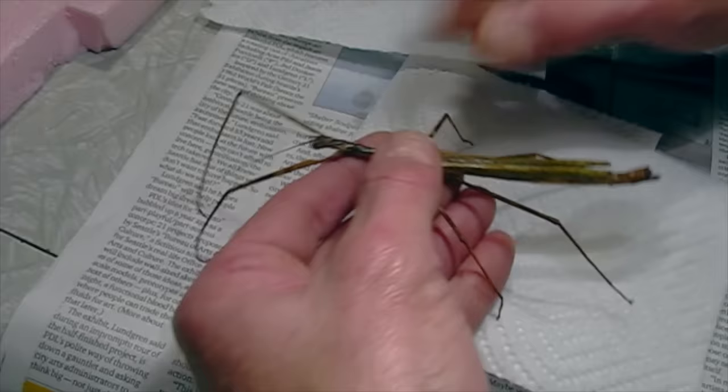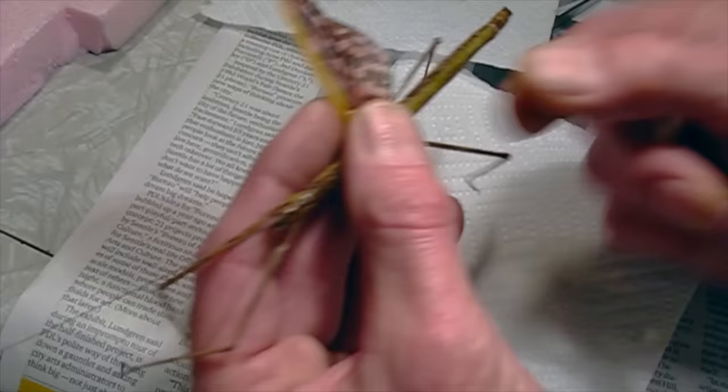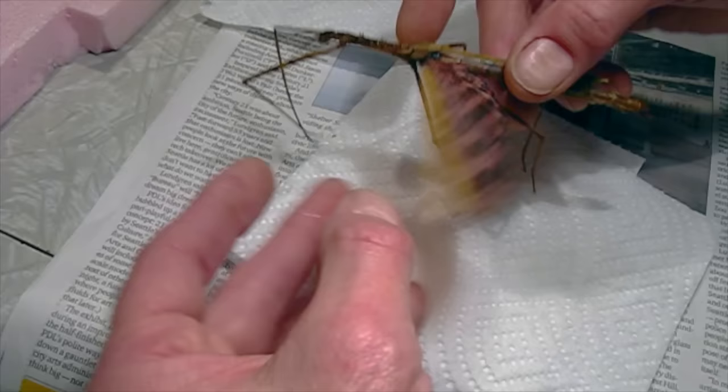This has been soaking in acetone for about 10 minutes and it seems to have stiffened it up nicely. The wings are still able to spread. Dry those out a little bit — acetone is amazing stuff, it certainly gives you good results with preservation.